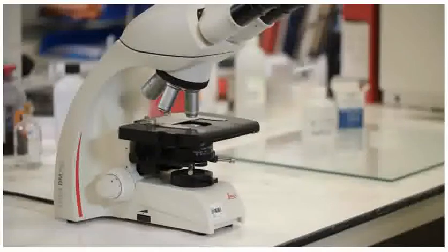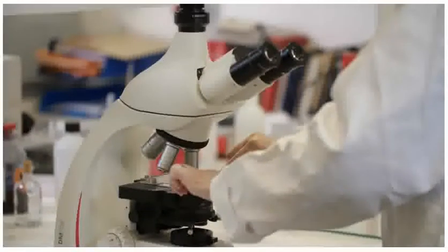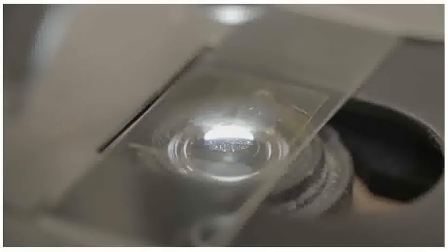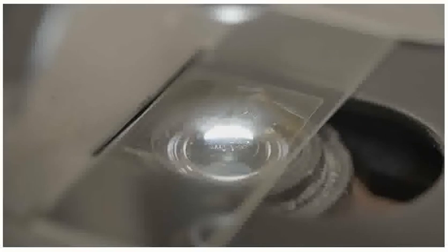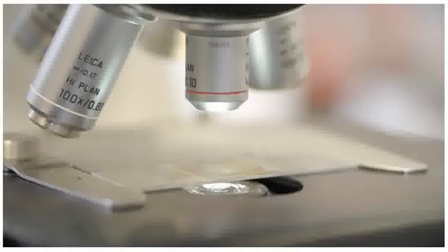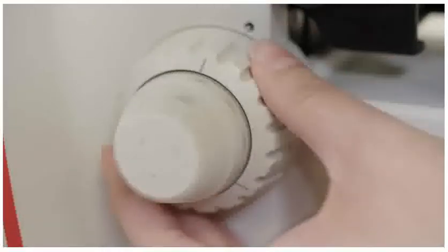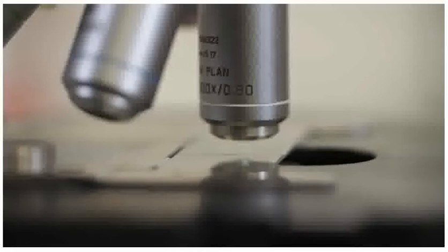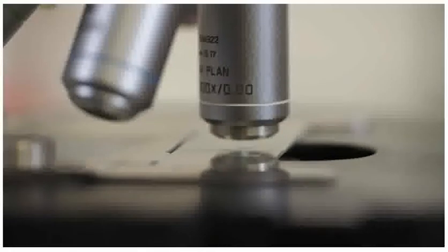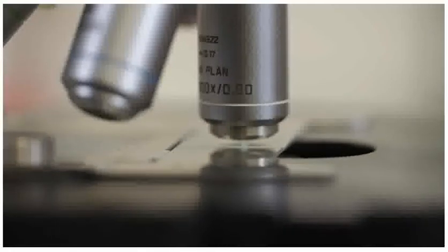The slide is placed onto the stage of the microscope so that the part of the slide with the onion cells is over the hole in the stage. The least powerful lens is selected. Looking from the side of the microscope, the focusing dial is turned until the stage is as high as it will go without touching the slide. If the lens touches the slide, the slide could break.